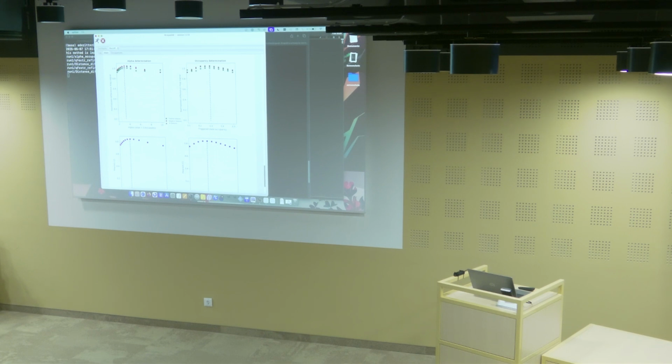So this is shown here, and there's two methods. One is called the maximization, and the other the Pearson correlation method. Again, please read the documentation or reach out to me later. Then we have a tab for occupancies, where we have something about negatives, completeness, signal to noise. Let's see if we update this. This is still running.